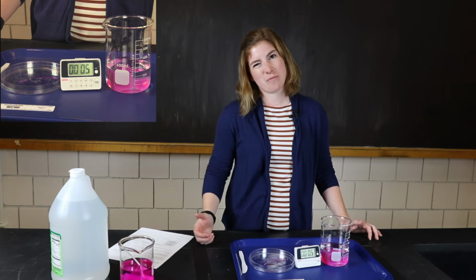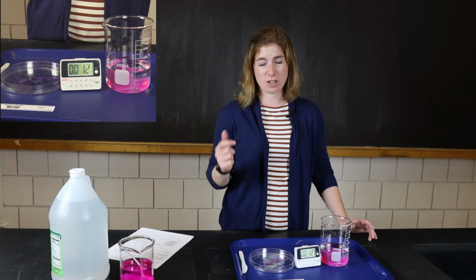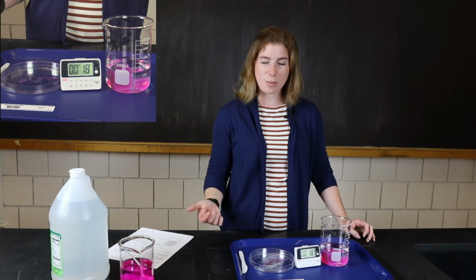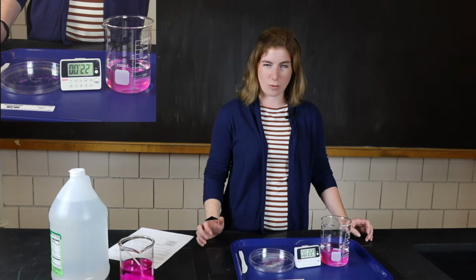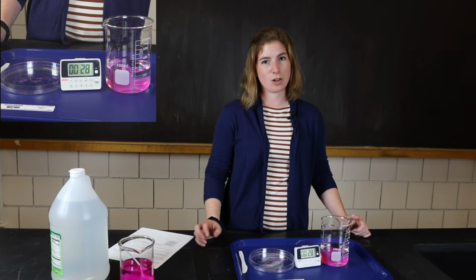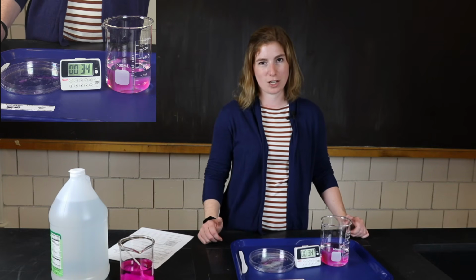And we're going to let it go. Our hope is that we should probably time this for about 15 minutes, but if our small cube gets all the way diffused or clear before that 15 minutes hits, then we'll stop it then. So I'm going to keep an eye on it. You guys can follow along with the video. We won't make you watch for an actual 15 minutes. We'll see how long it takes for that small 1 centimeter cube to diffuse all the way through with the vinegar, or we'll stop it after 15 minutes, whichever one comes first.